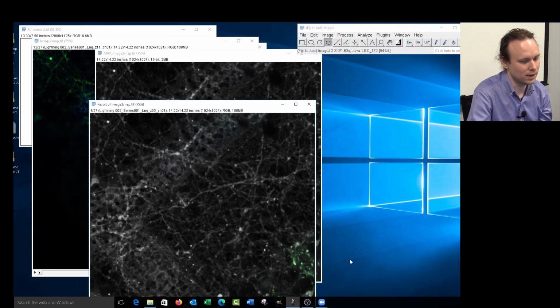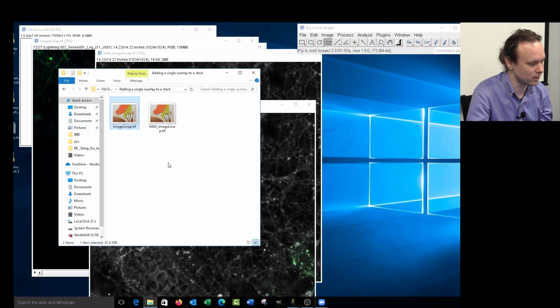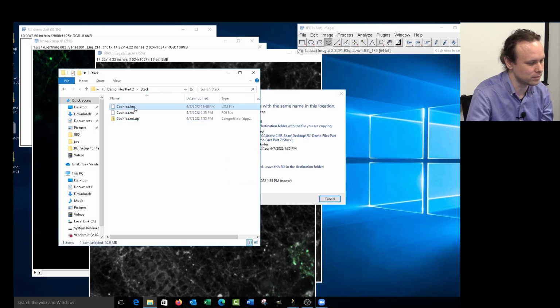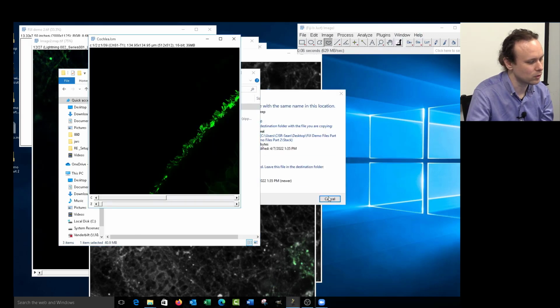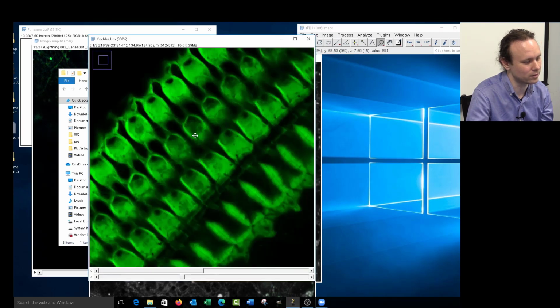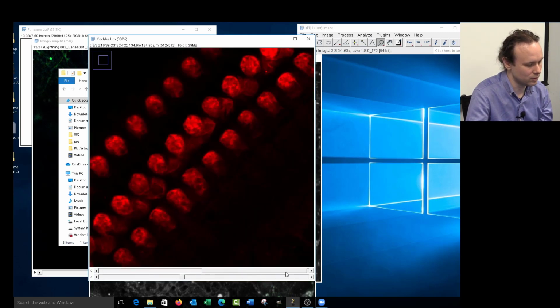If you're doing TEM, you're actually looking for dark things, usually not bright, although you could invert it if you were interested in that. I don't have any TEM examples for this one. But yeah, FIJI doesn't necessarily care too much about pixel values. To it, it's always just gray values, even though it looks like it's green or red. To FIJI, it's just reading the actual intensity.